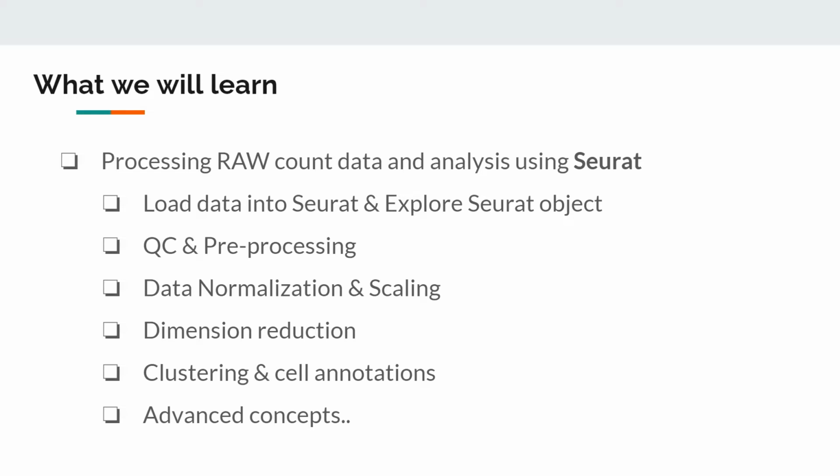So you can see that there are multiple steps in the pipeline and each of the steps is very important. We need to understand why we are doing that and how we are doing it. Whenever you are learning, we need to learn about two things: why we are doing it and how we are doing it. That's why I will be splitting this Seurat pipeline into multiple videos, so that we can talk about each of these concepts in detail.